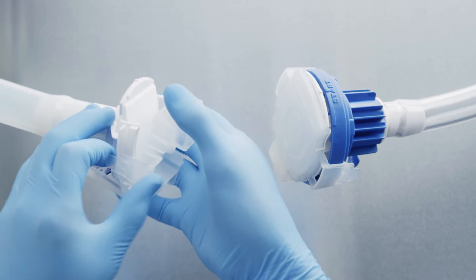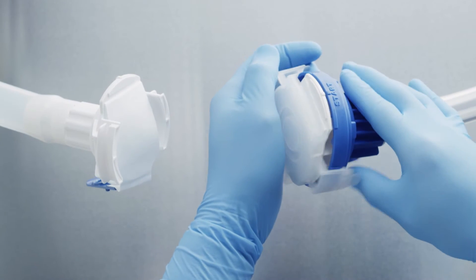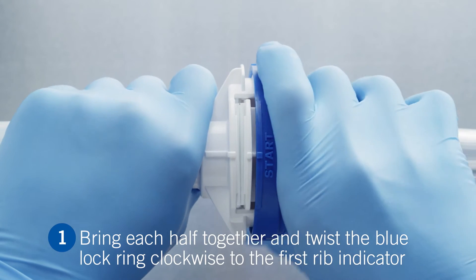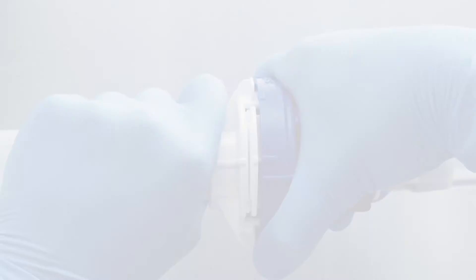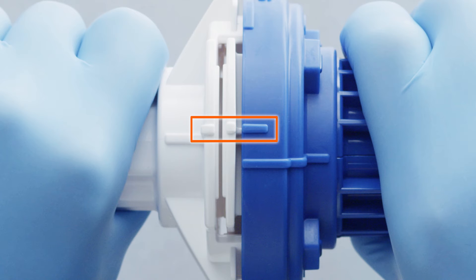Remove the protective cover on each connector half. Bring each half together and twist the blue lock ring clockwise until a click is heard. Alignment of the small blue rib indicator with the white rib indicator confirms the rotation is complete.